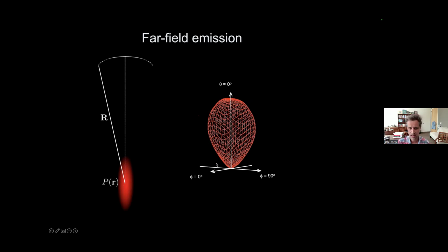And that's what you get when you plot that effect. You see this lobe structure. So this is basically the intensity that you see as a function of you walking on that far field hemisurface. Okay, so if you are in the middle of a hemisurface, right there, then you are right there, okay? It means maximum signal. But if you walk away from it, so towards the edges, you see, it goes down, down, down, down, down, till 0, which is all the way 90 degrees, then you see nothing, okay? So this is the far field radiation profile that comes out from this coherent process.